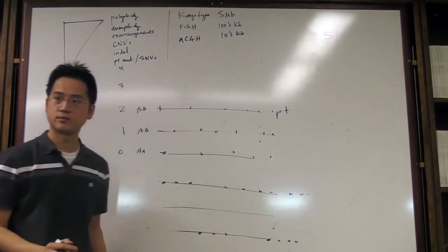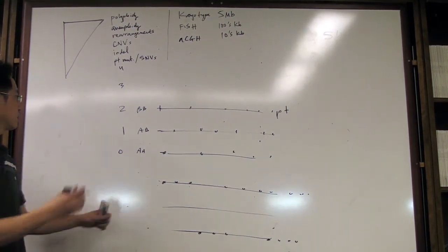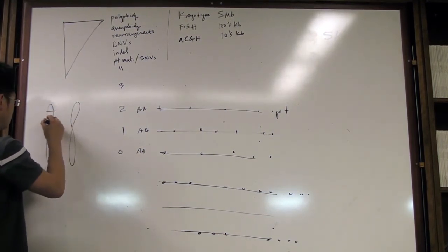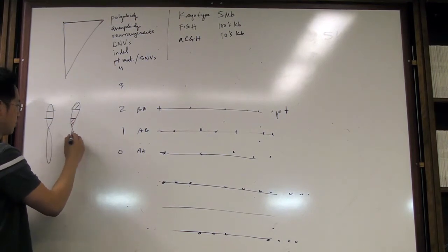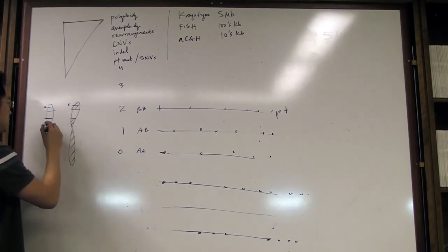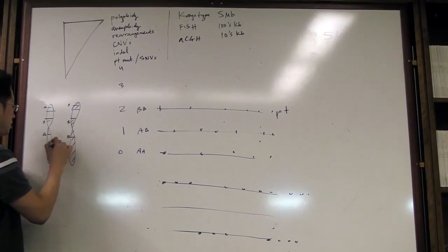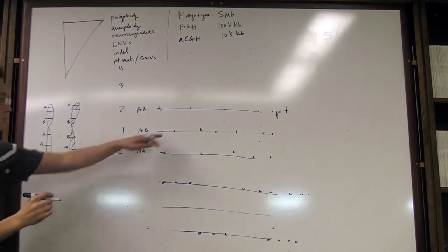See what's going on? There's a loss of heterozygosity. And why is that? If I go back and draw those two alleles, remember this portion is exactly the same from Dad. So probably most of these here, sometimes it shows an A, sometimes it shows a B, sometimes there's a B, B here, sometimes there's an A, there's a B, there's a B, there's an A, there's a B, there's a B here. So it looks like this situation.